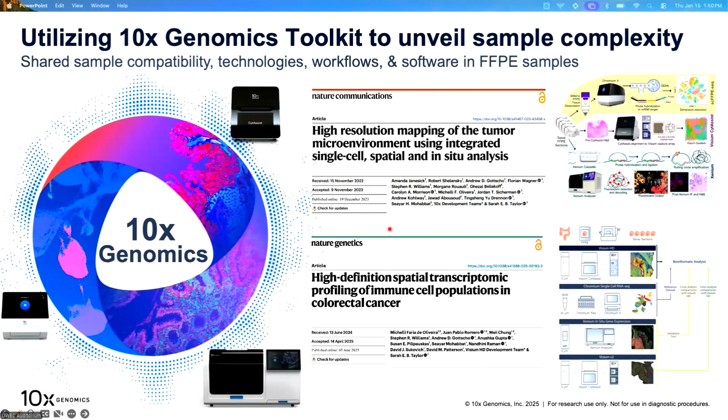And the tissue at that point is essentially gone. You won't be able to recover it. With Xenium, it's a little bit different. Essentially, we do a gentle permeabilization, and then we do a probe hybridization, and then we read the signal in situ. So it's really a different way. And then for Visium, of course, we make a library. So, yeah, sure.